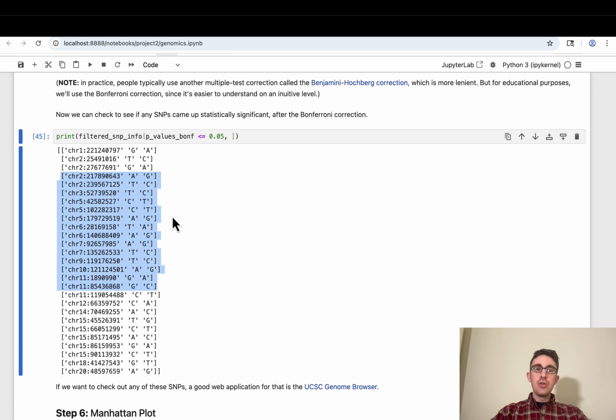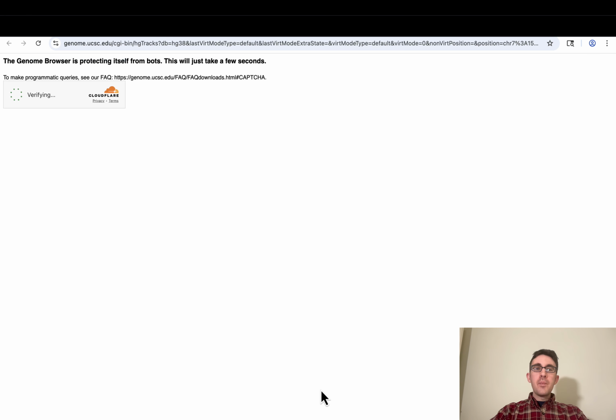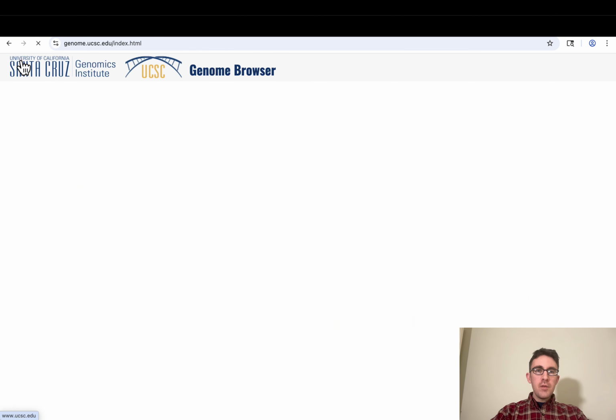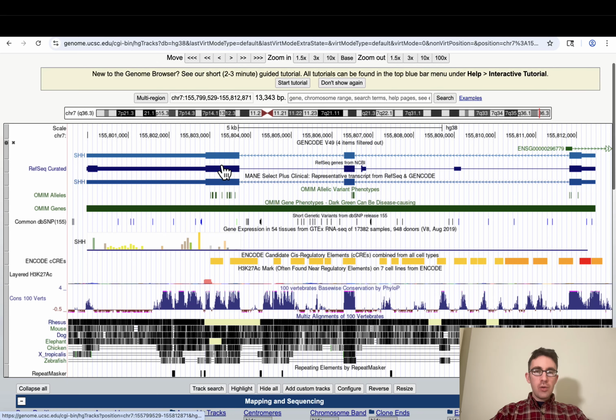So in this video, I'm just going to show you a quick lesson on a cool resource that you can use to investigate particular SNPs that you might be interested in. The tool is called the UCSC Genome Browser, and if you're following along in the notebook, you can just click this link. But if you're not using the notebook, then you can find it by going to genome.ucsc.edu, and then I think you might have to go to Genome Browser over here. But this is what it looks like.